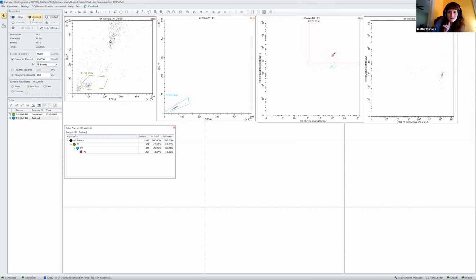Okay, there it is. Go ahead and select record. Yes. Oh, I didn't change the stopping events though, so that's why it says 100,000 all events, which is perfectly fine. We're okay there.